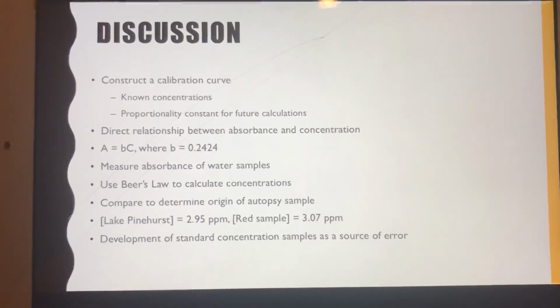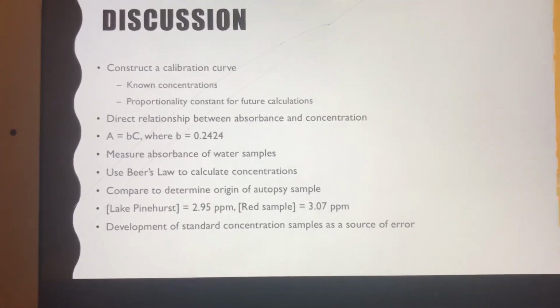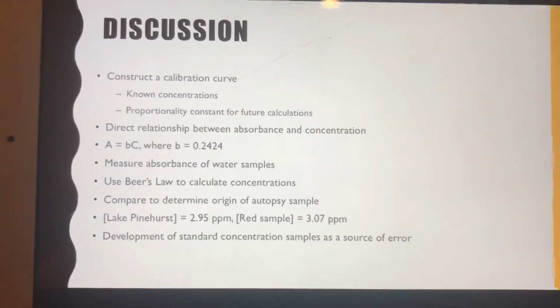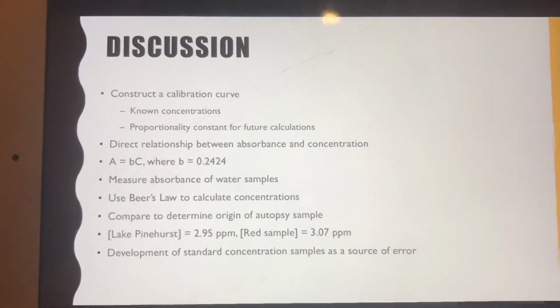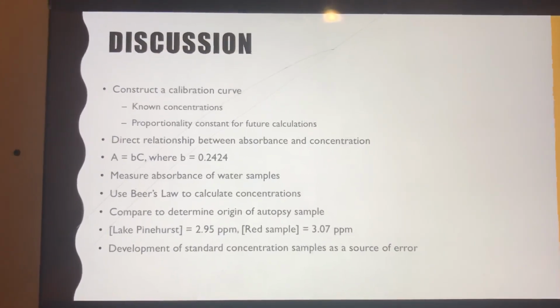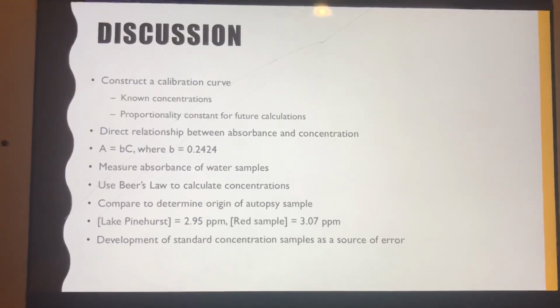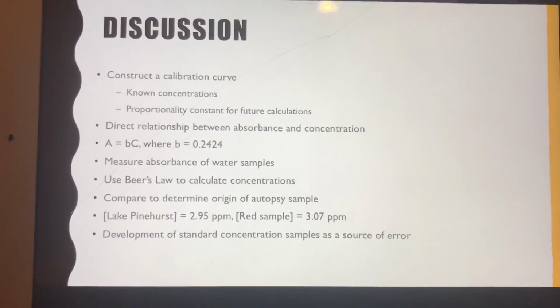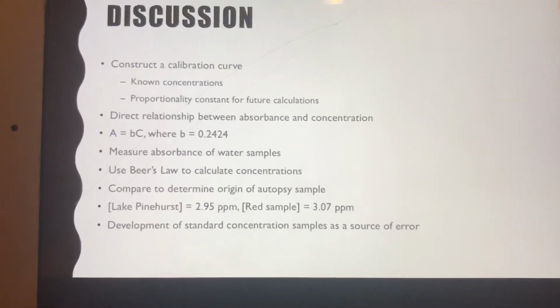One thing asked for in this experiment was to determine a source of error, and human error doesn't count, which there is in almost every experiment. The source of error I selected: phosphate is not visible to the spectrophotometer at the wavelength that the spectrophotometer transmits light. So we have to find a way to make it visible. By putting in ammonium molybdate and stannous chloride, it turns the solution a bluish color, like a smoky blue almost.